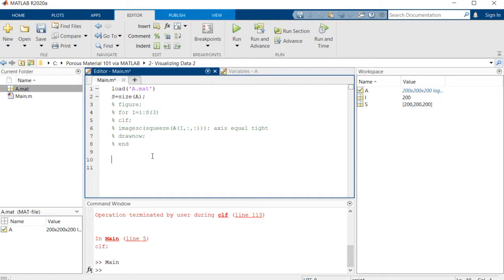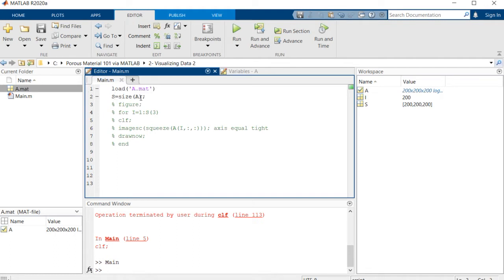I want to load this matrix I have in my directory and s is the size of this matrix. It's an array with three different elements, sorry, three the same elements.